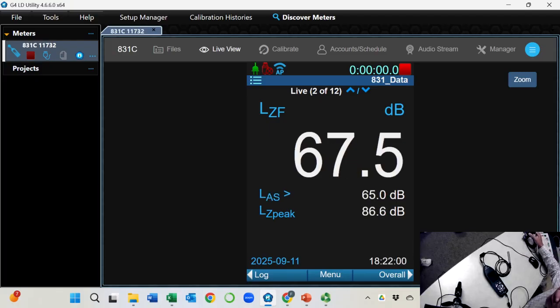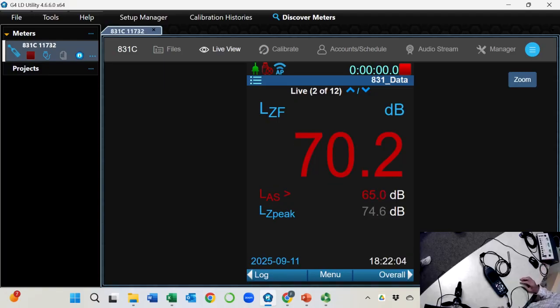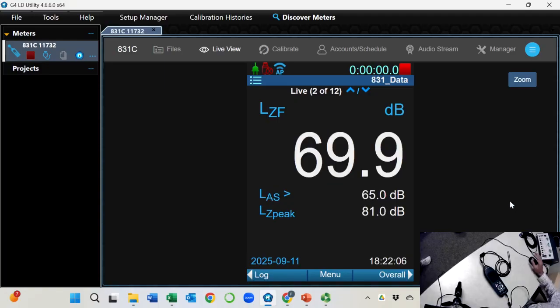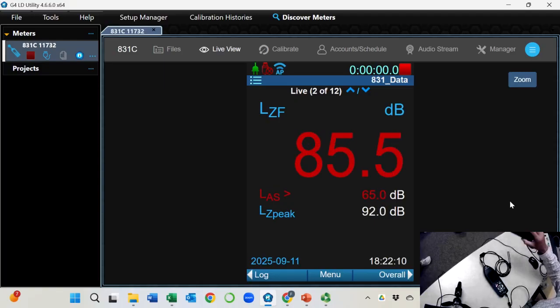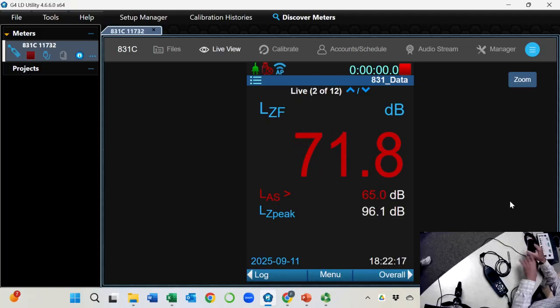Longer than 60 seconds. I'll just be patient. Okay. It goes off. It's a long 1 minute. It's gone. Okay. There's no off button. If you try to press it, you will never stop.